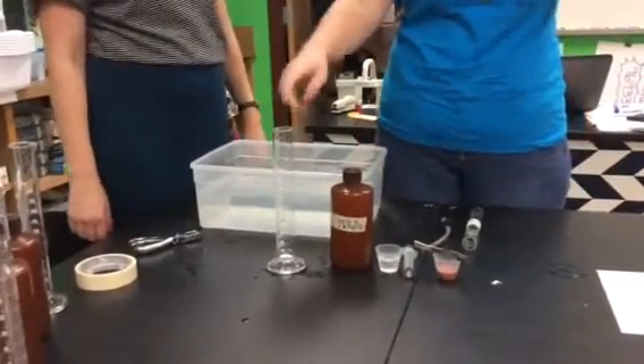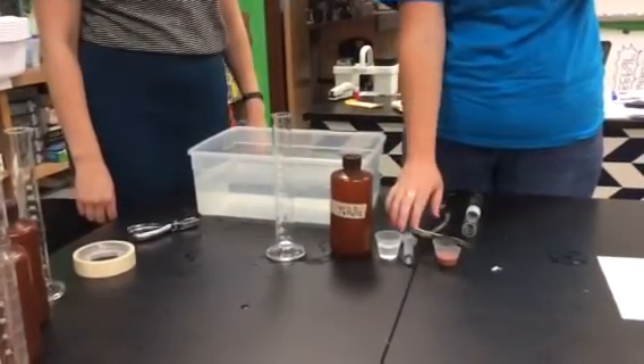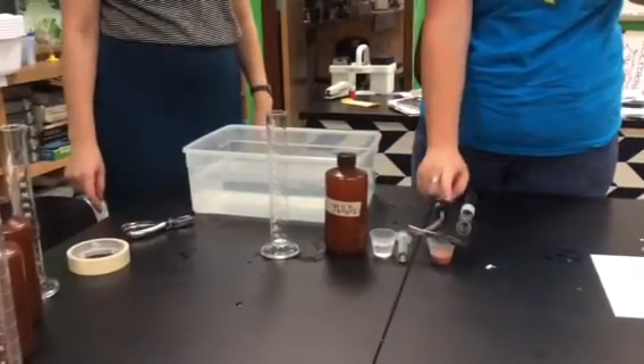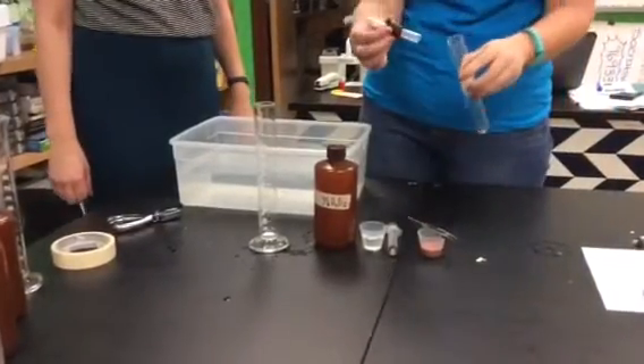For this lab, you need one graduated cylinder, you're going to need some hydrogen peroxide, which is also known as H2O2, you're going to need a 10 milliliters syringe or a 5 milliliters syringe. This is our liver solution, which has the enzyme catalase in it, a pair of forceps, some paper discs, and this is our reaction chamber.